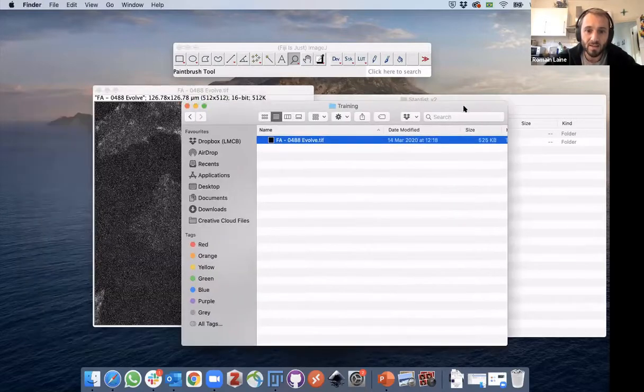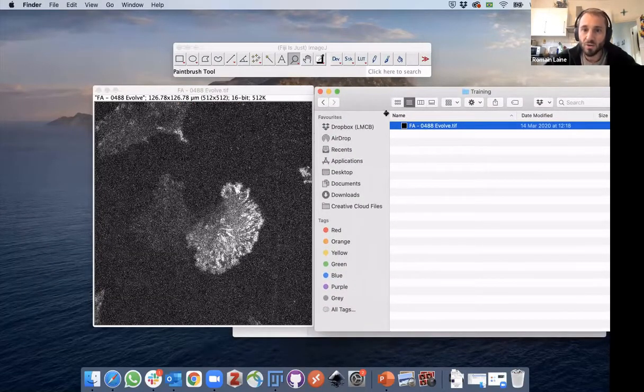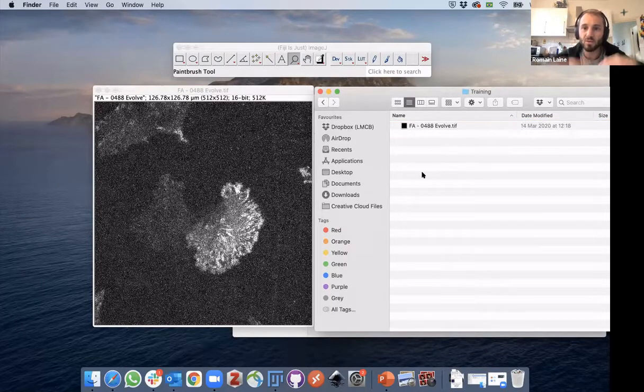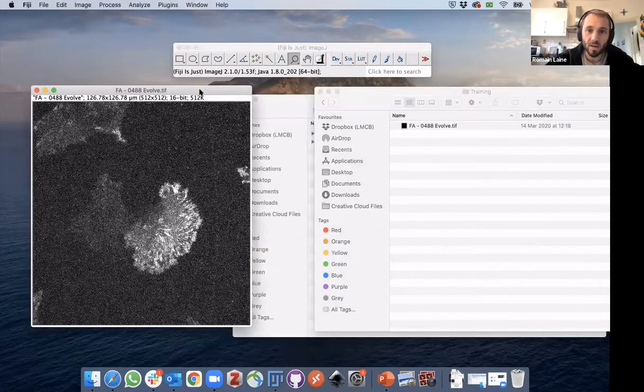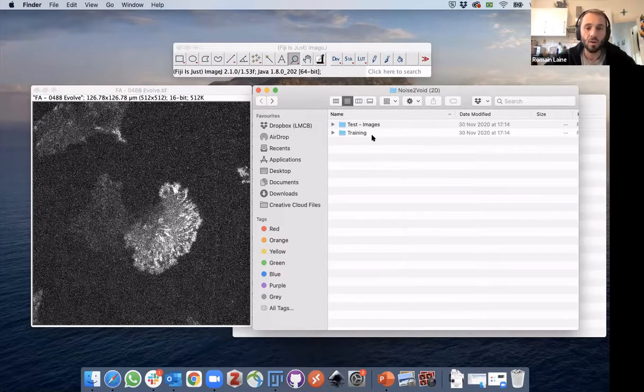So in the particular case of one use case of Noise2Void, the one we're going to be doing today, is to want to denoise, say, a time series of a fluorescence cell migration assay from fluorescence data like this. And as we said already earlier, using low power is great for time courses because we reduce phototoxicity.